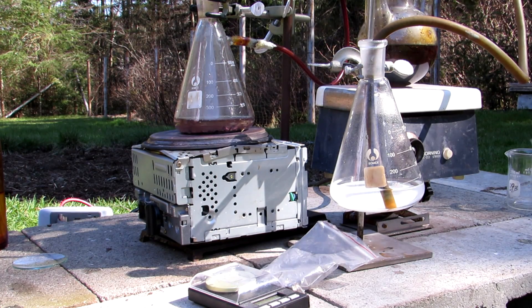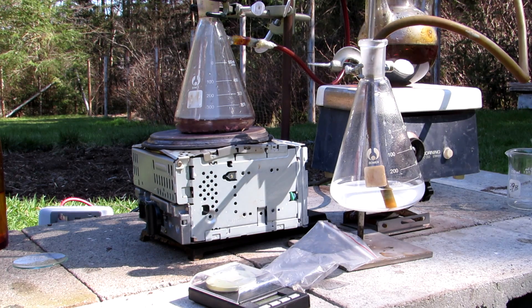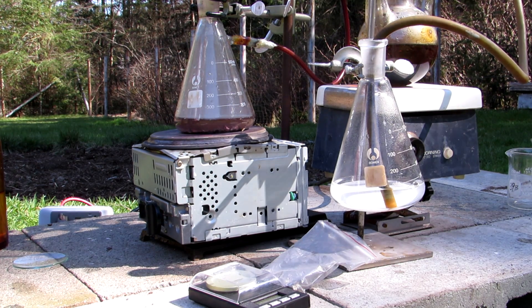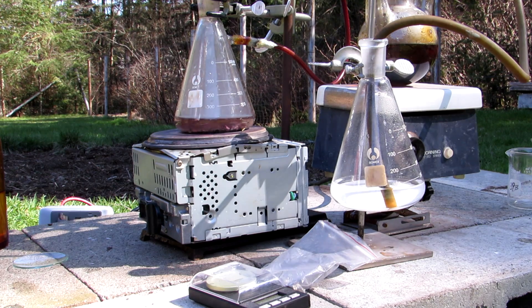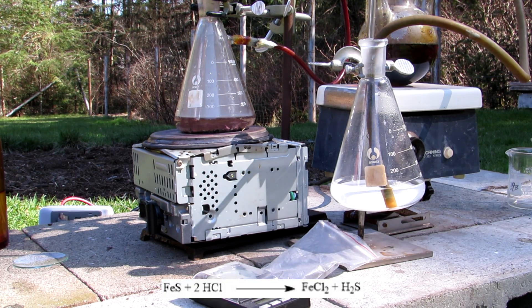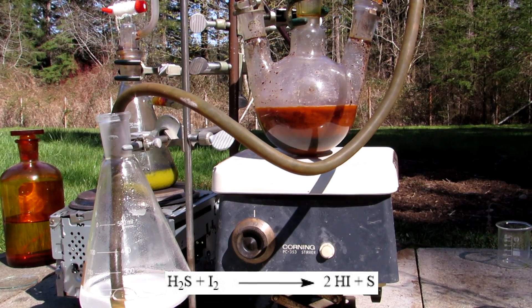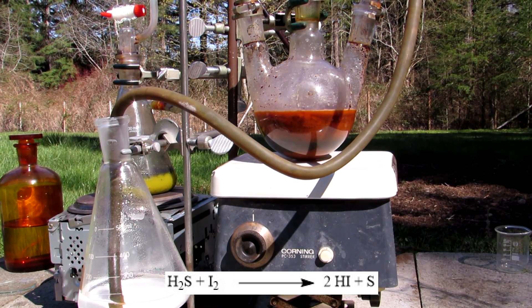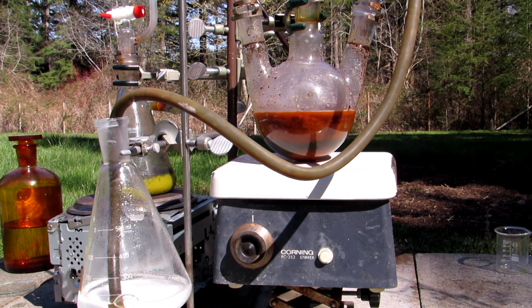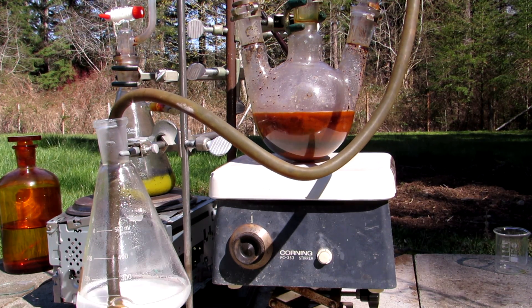The stopcock of the addition funnel was opened slightly to begin generating hydrogen sulfide gas, and the Erlenmeyer flask was heated with a hot plate to help speed up the reaction. It is important to wear a gas mask and perform this in a fume hood or outside, as hydrogen sulfide is highly toxic. The hydrochloric acid reacts with the iron sulfide to produce iron(II) chloride and hydrogen sulfide gas. The hydrogen sulfide gas then reacts with the iodine in solution to form hydroiodic acid and elemental sulfur. Iodine is not very water soluble, so the strong stirring helps to dissolve the iodine as the reaction proceeds.